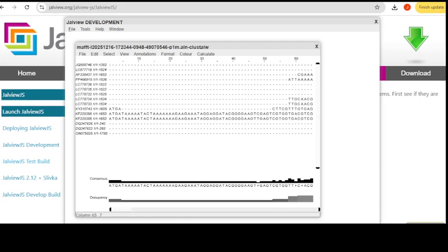The rest you don't have to worry about. But this is the depth, okay? This is telling you how many reads are in this particular place and also giving you the percentage of the base. How many reads are calling C? And that is 33% is calling C, okay?